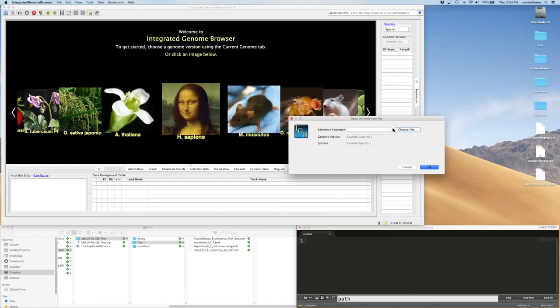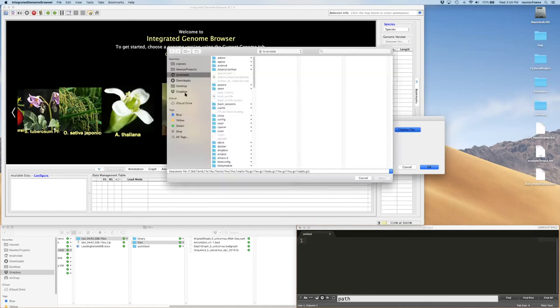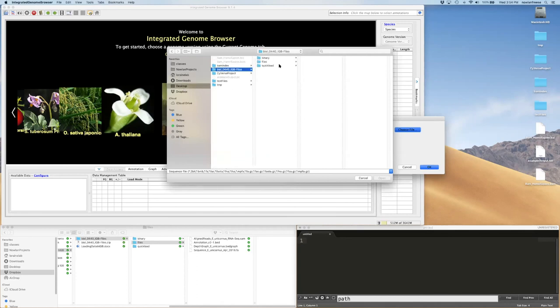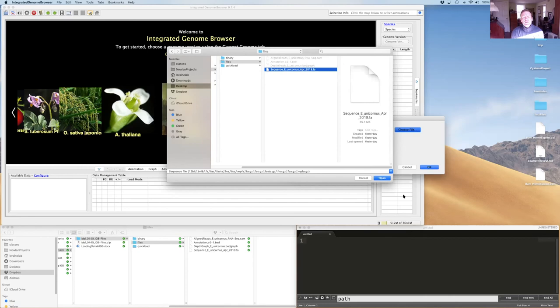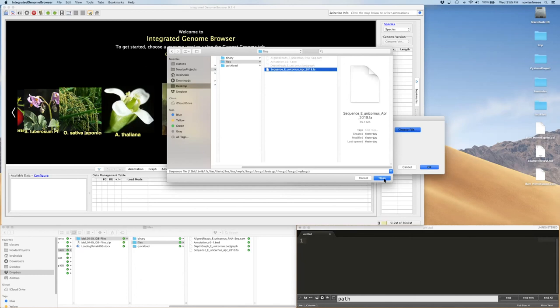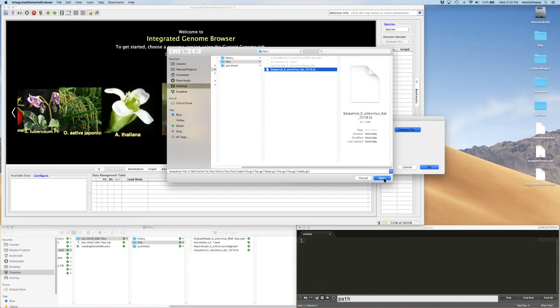For this demo using the test data provided: choose File → Open Genome from File, select the FASTA file. I'm in the IGB files directory, selecting 'sequence_unicornis'. This genome has three chromosomes and looks similar to the Arabidopsis genome — it's our example unicorn genome from the IGB user's guide.